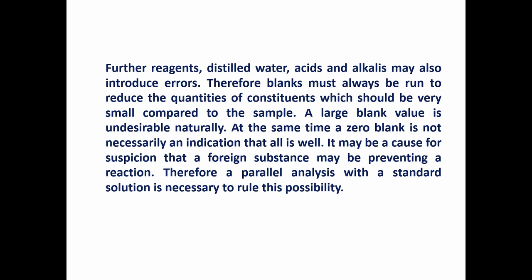So you have to use very high grade chemicals, especially what are known as AR reagents or guaranteed reagents. Sometimes even the solvents have to be spectrographic grade, HPLC grade or something like that, which are highly purified.